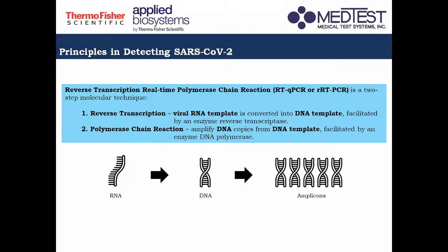So ito na yung issue na, or what if kaya yung na-collect kong samples ay konti lang. No? Actually, we have the saying in molecular biology that less is more. So, ibig sabihin, kahit konti lang po yung na-collect nating cells, we would eventually get a higher amount of our target material with the use of this technique called polymerase chain reaction.